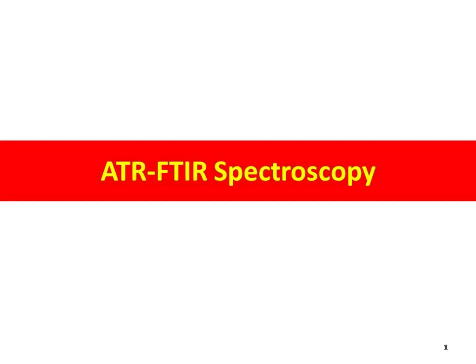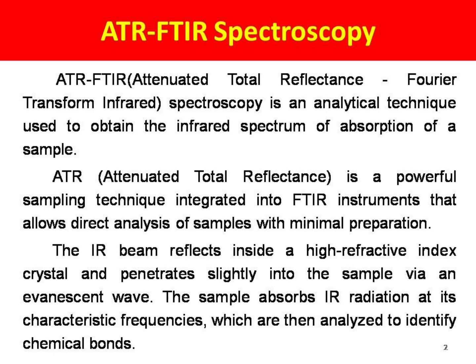ATR FTIR spectroscopy. ATR FTIR spectroscopy is an analytical technique used to obtain the infrared spectrum of absorption of a sample.